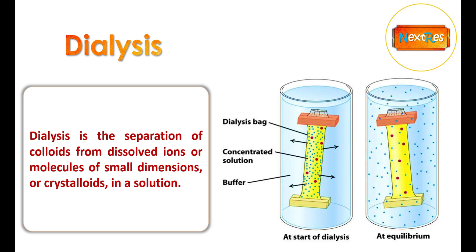Dialysis. The last two purification techniques help in the removal of larger entities, but what about the smaller unreacted molecules? The solution is the use of a dialysis bag. In the dialysis technique, the quantum dot solution is placed in a dialysis bag, which is closed at both ends and immersed in the purifying solvent — generally water — as you can see in this picture. After this technique, you can collect your pure quantum dots.